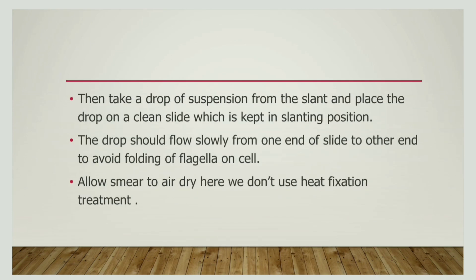After the suspension is ready, we have to take a drop of the suspension from the slant and put it on a clean slide. The clean slide must be held in a slanting position so that the drop moves slowly from one end to the other. This is done so that the flagella does not fold. Allow it to air dry.